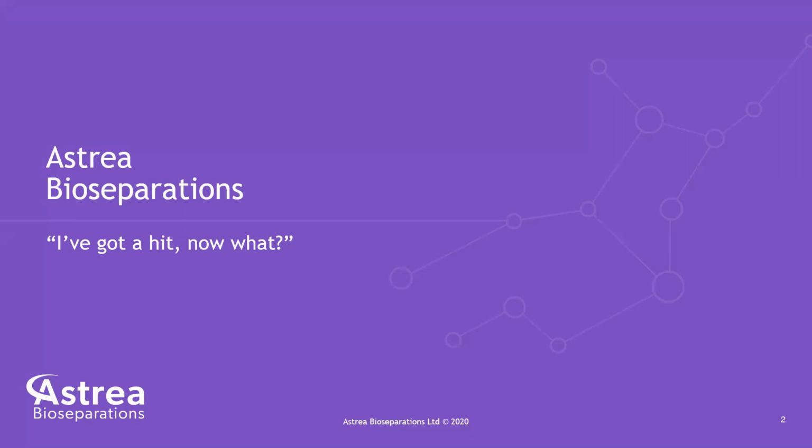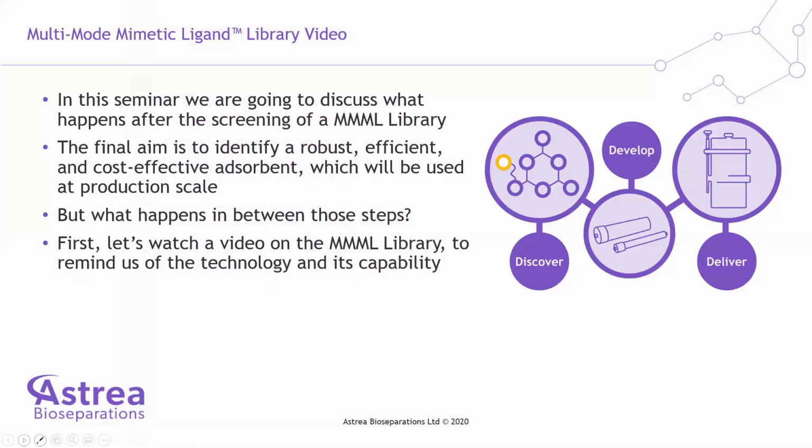We are going to talk a little bit today about what happens after you find a hit from one of the MMM plates. So we're going to talk, as I said, about what happens after we get a hit, after you have done a screening of one of our MMM plates.